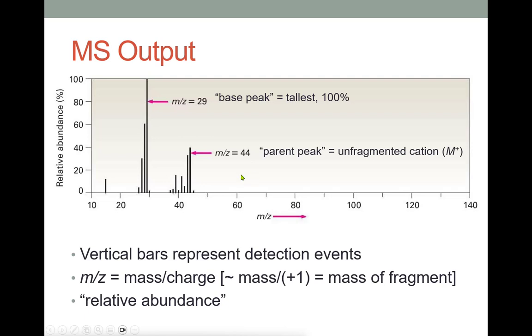Okay. We do see a little tiny blip after that, higher than that, and that actually is due to isotope variance. So if you remember from Gen Chem and from your isotope discussions back then, most carbon in our organic molecules has a mass of about 12 mass units, but a small fraction of the carbons have a mass of 13. Similarly, the vast majority of hydrogen has a mass of 1. A little tiny bit of hydrogen has a mass of 2. The same kind of thing is true for nitrogen and for oxygen and for chlorine and bromine and other atoms.